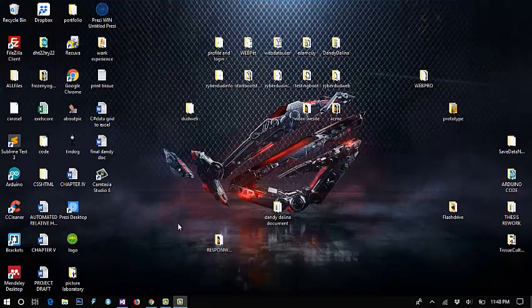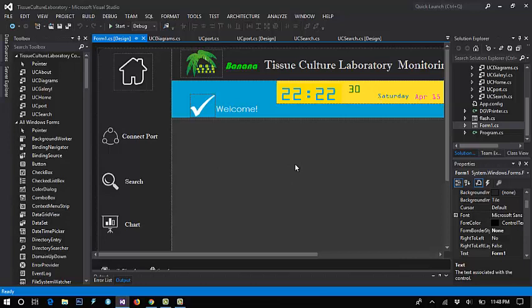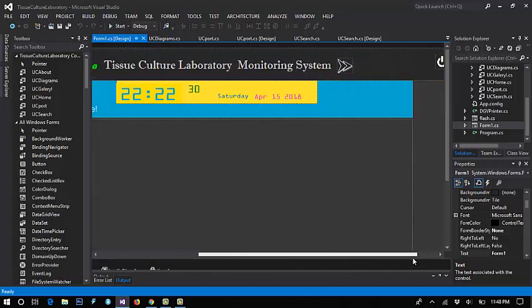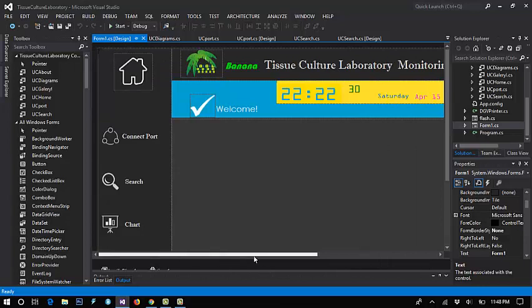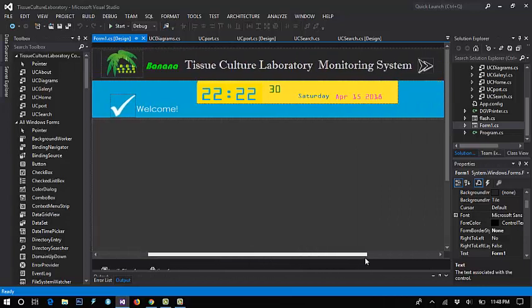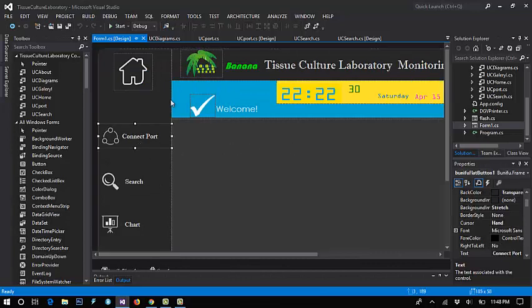Okay guys, to continue this video I will show you a monitoring system for my prototype of tissue culture laboratory. Let's open Visual Studio because I created my project here. The appearance is like this, this is the connect part. Let's try to run this project.